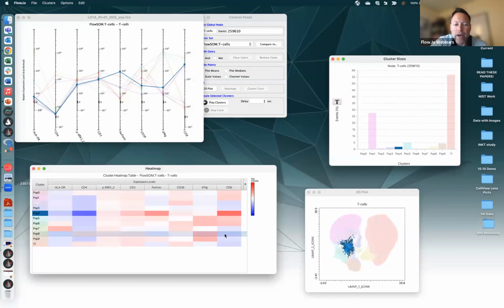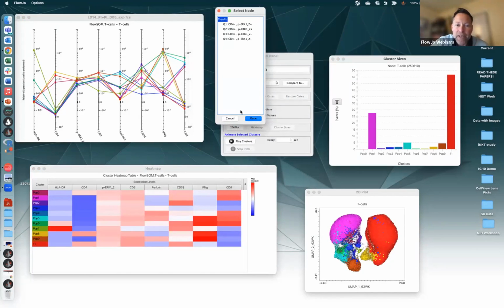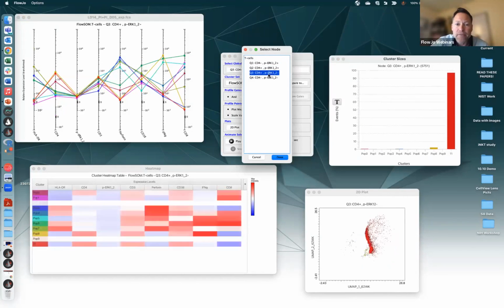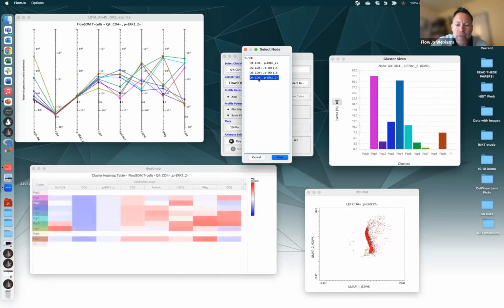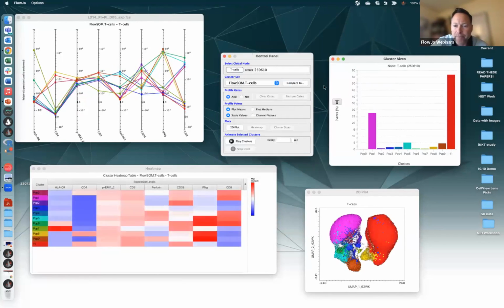Okay. Other thing I should show is if I can get to this, and I think I can. This was behind my Zoom. Oh, I can drag it down. Good. Yeah, I made it. Okay, that's it, done. Right here, what are we looking at? We're looking at T cells, that parent population. Because I've selected just these gates, I can show the individual gates and so forth also as just how did the cells in each of those gates fall amongst all my clusters. All right, so there's that.